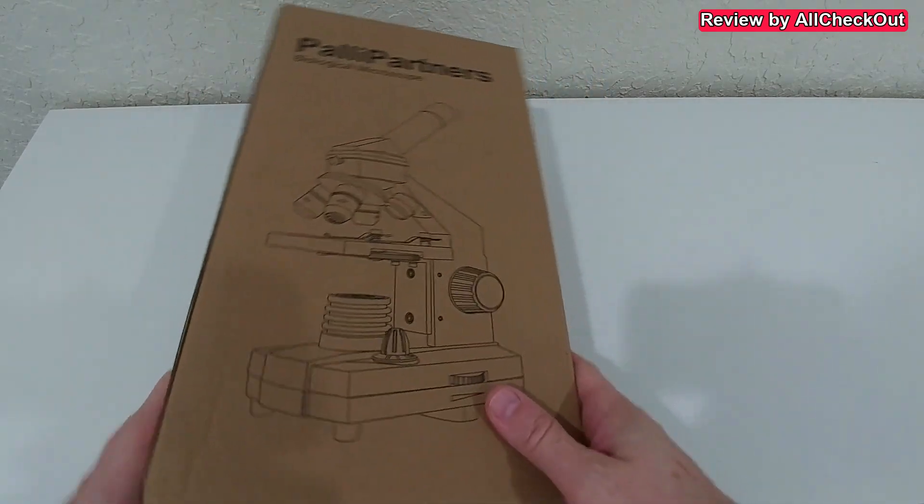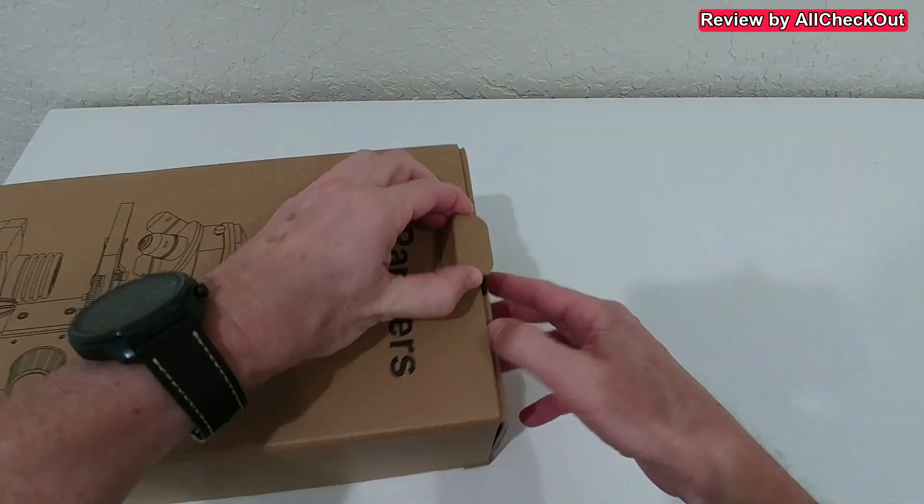Hi guys, welcome to the unboxing and quick review of this Polypartners microscope. It says it has a magnification of up to 2000x, comes with five different colors, two lights — one from the top and one from underneath — exactly how it should be. It also comes with a phone adapter, so it has pretty much everything we need. I'm going to take it out of the box, show you what you get, and then try to use it and show what you can really see with it.